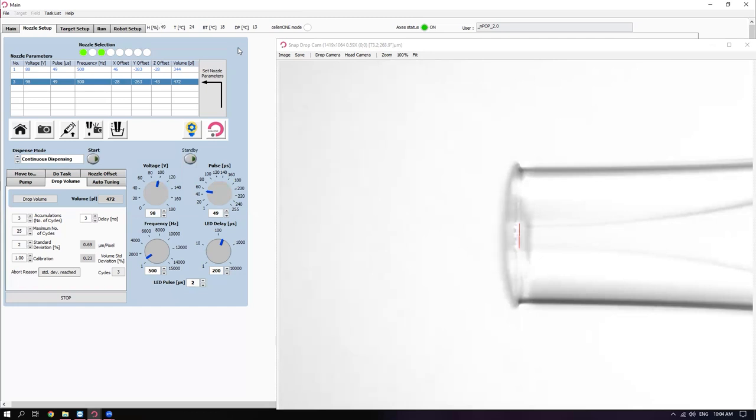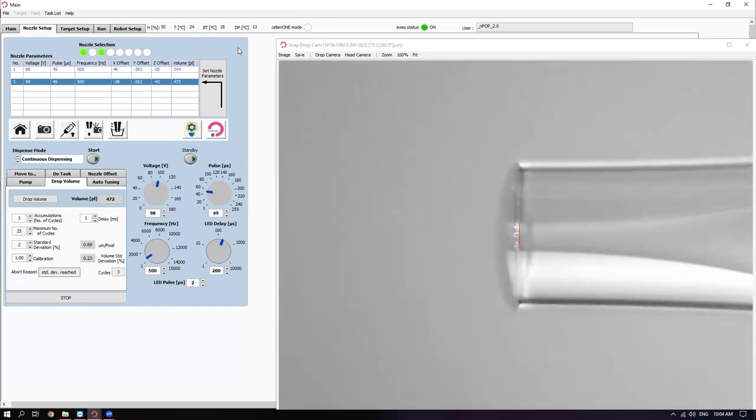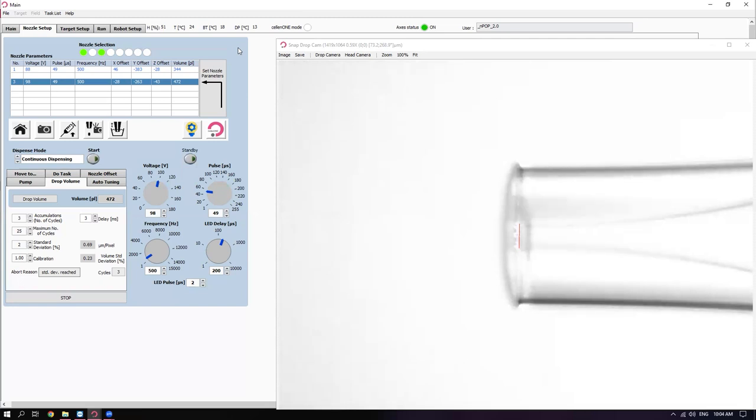Yeah, absolutely. Here is a little instrument overview. On the left, we have a heating chilling water bath, and a humidifier. Those things allow us to do environmental controls and long incubations with very small volumes with minimal evaporation and condensation.